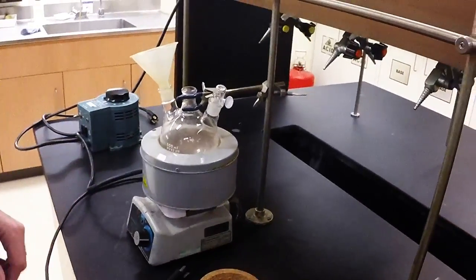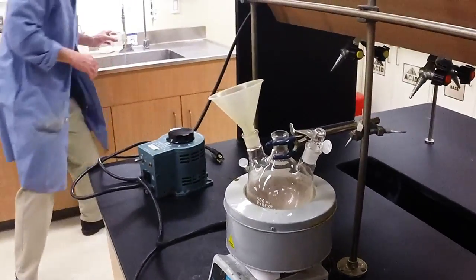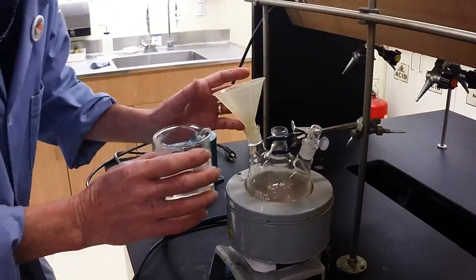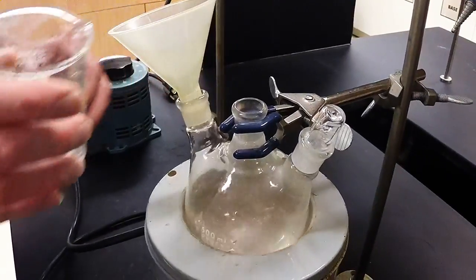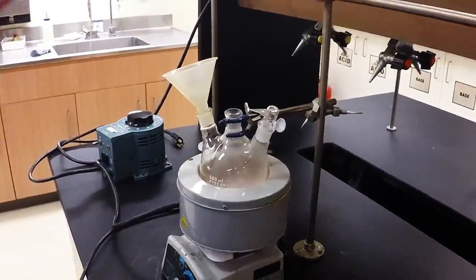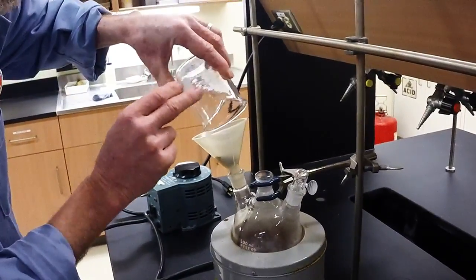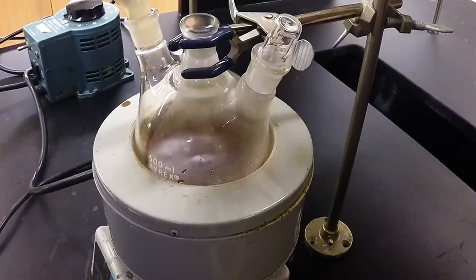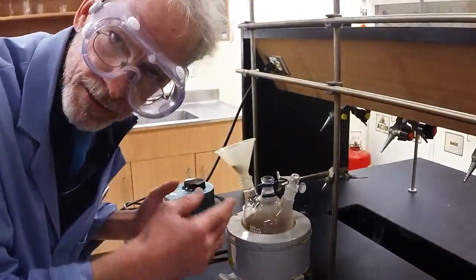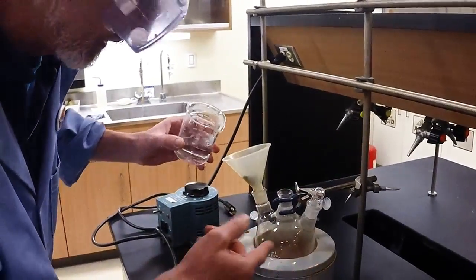I've got to stir, and I find that this works best if you add half your hot water from the tap — tap water, because we're going to boil it anyway. So if you start with hot water, life is easier. We got our 10 grams of clove powder, and see it's stirring in there. The cloves tend to settle to the bottom and make the stir bar unhappy.